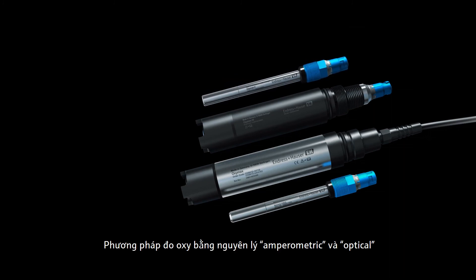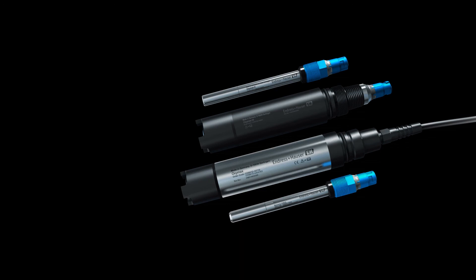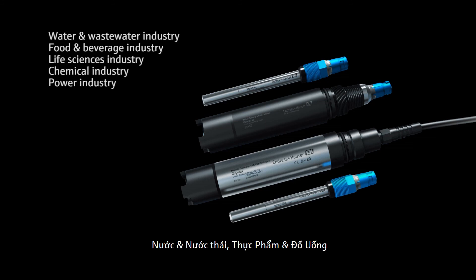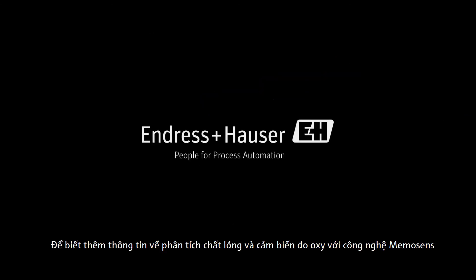Amperometric and optical oxygen measurement is essential for quality assurance and process control in many industries such as water and wastewater, food and beverage, life sciences, chemical, and power industry.